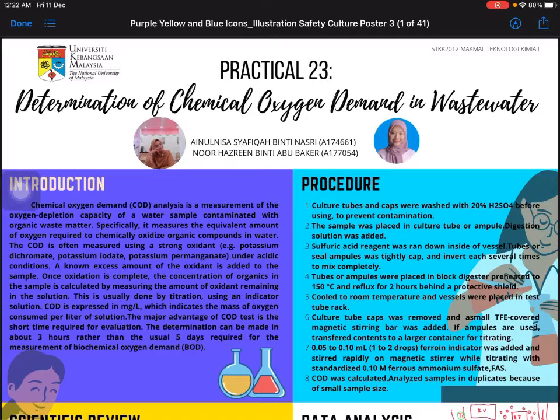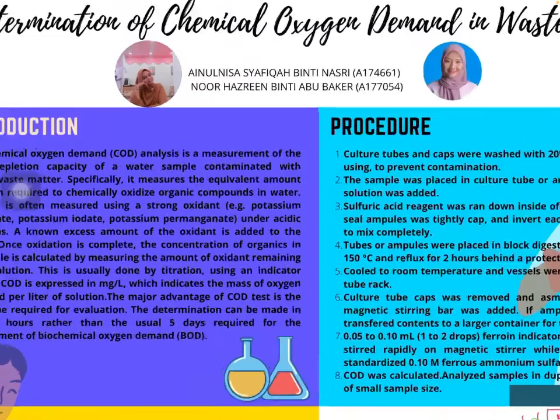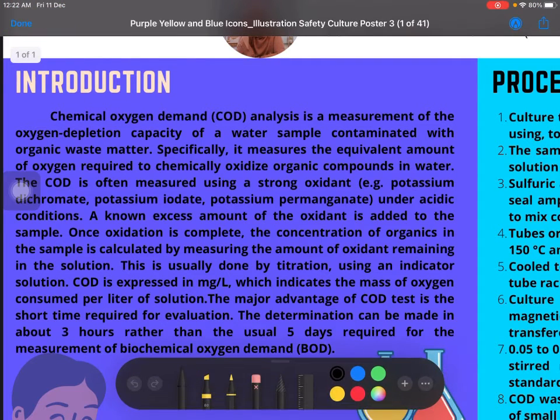Practical 23, Determination of Chemical Oxygen Demand in Wastewater. Chemical oxygen demand (COD) analysis is a measurement of the oxygen depletion capacity of a water sample contaminated with organic waste matter. Specifically, it measures the equivalent amount of oxygen required to chemically oxidize organic compounds in water.